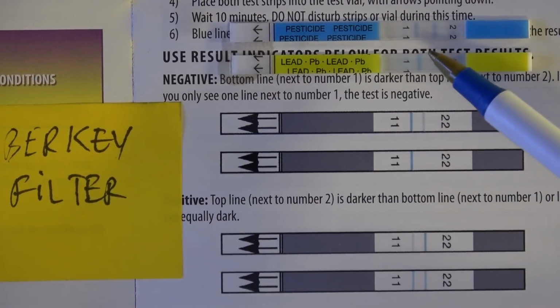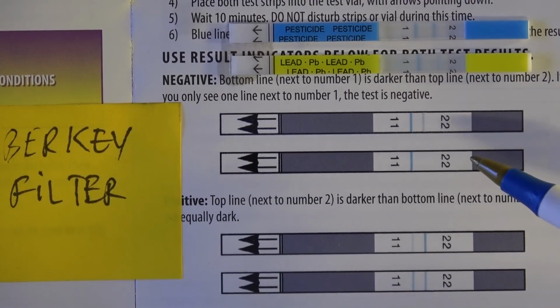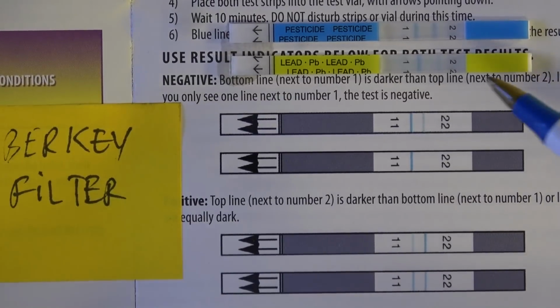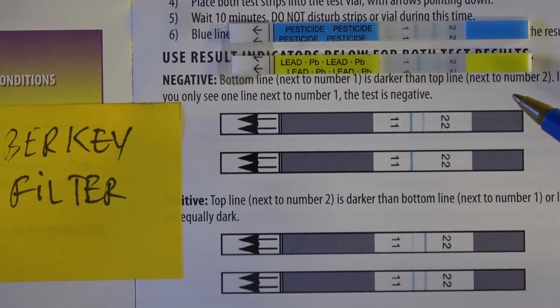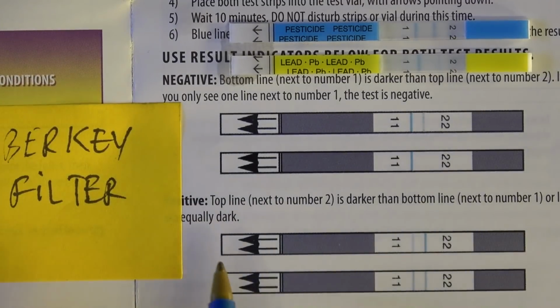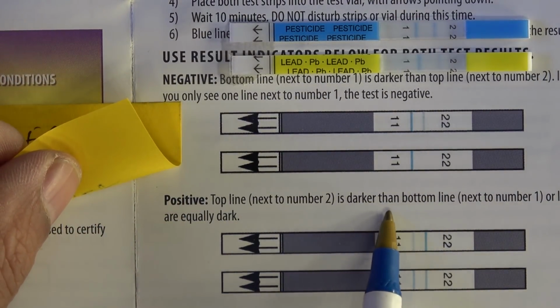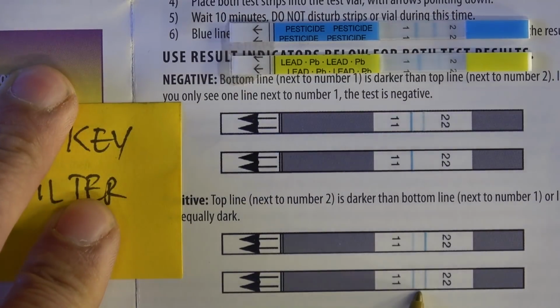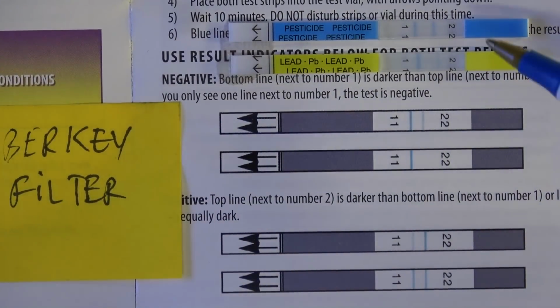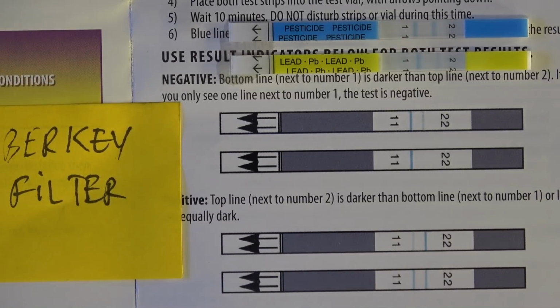On the pesticide strip, the blue line on 2 is as dark as the blue line on 1. I would say just a little bit less dark on 2, but it looks the same to me, almost the same. So I would say it is positive. We see here the chart says positive: the line 2 has to be darker or equally dark. Okay, which is this. So the pesticide is positive. So there are still pesticides in the Berkey filter water. There is no lead in this water.